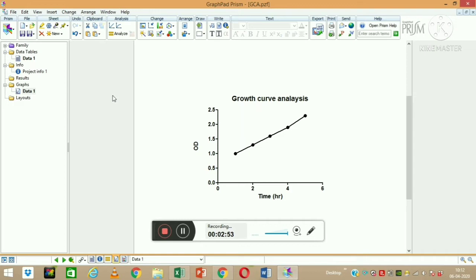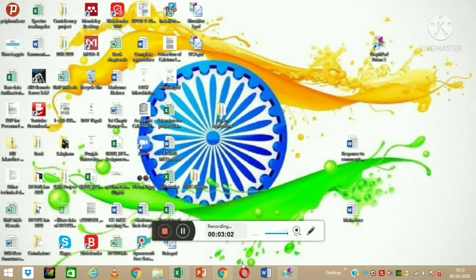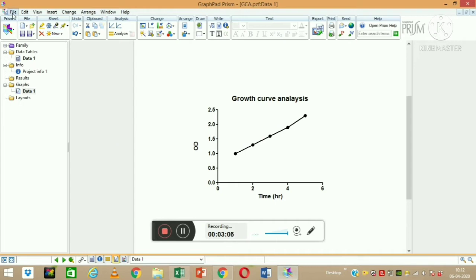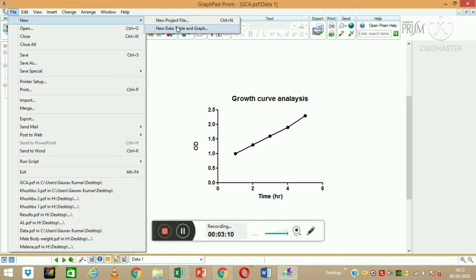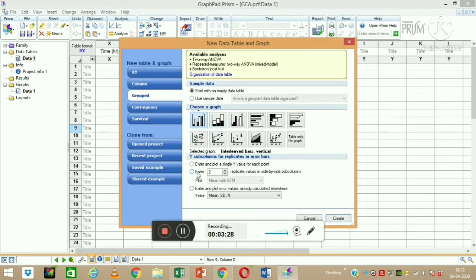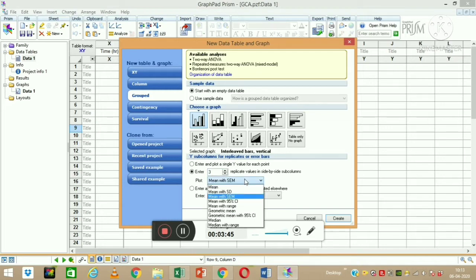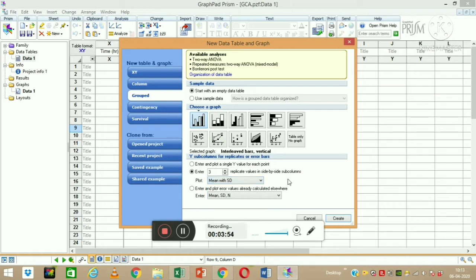If we have multiple Y values or different replicates, we can go back to the starting point, or if we want to continue in the same file, we can go to File > New and add a new page to the same file by clicking 'New Data Table and Graph.' Here we can select how many replicate values we have — for example, two or three replicates. It will then ask how you want to plot your data: usually mean with standard deviation, or mean with standard error. You can select any option based on your choice.